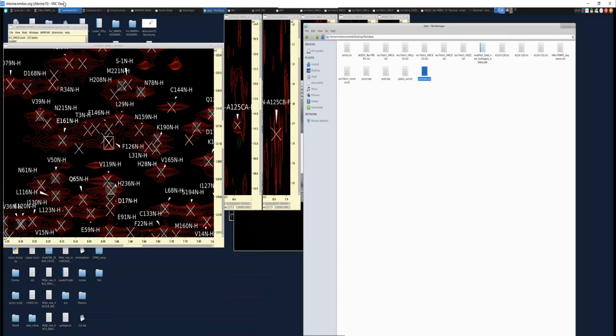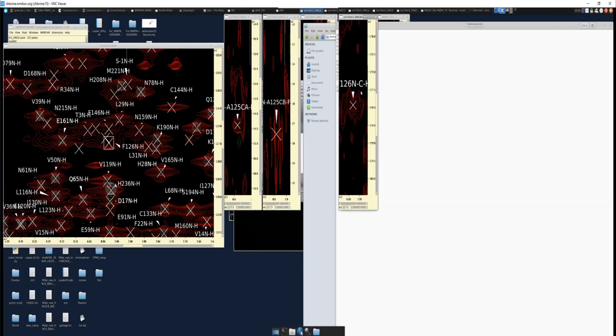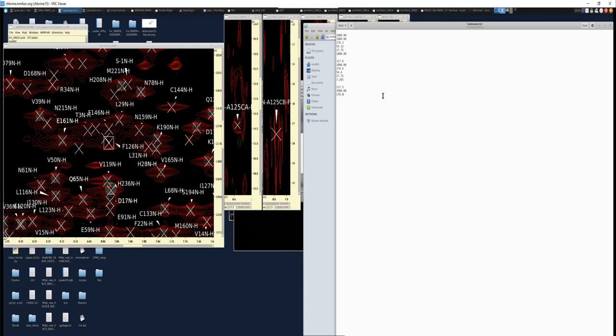Now, where's the one we had open? Right here. When you're working, it won't be assigned. It'll just be another unknown. So what you can do now is input the values in the same format. First the nitrogen, 117.5. Then the alpha hydrogen, which we don't have, so it's 1,000. Then the carbonyl, which comes from the HNCACO, 178.0. The C alpha, which in this case is 61.95.